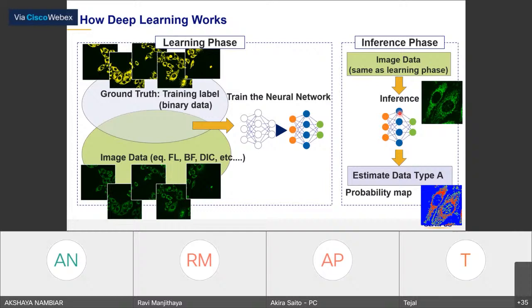There is a fluorescence image using MitoTracker, and we need to label where the mitochondria are, tell that this is the ground truth of the mitochondria, combine it with the image data, and train the neural network. Then the neural network will be created, and we bring another image and do the inference. Then you can see this kind of result after the inference.